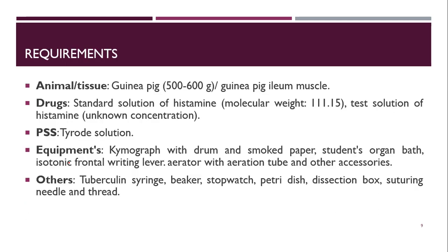Okay, so requirements. For the animal, we require a guinea pig whose weight should be between 500 to 600 gram, and the tissue which we have to extract is the guinea pig ileum muscle.